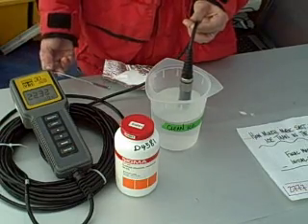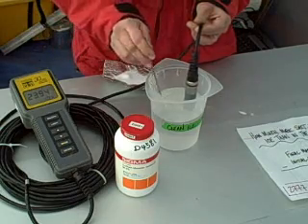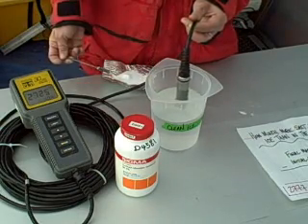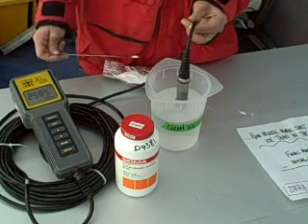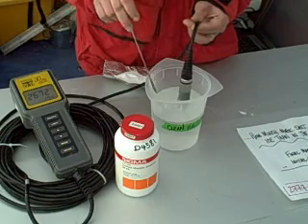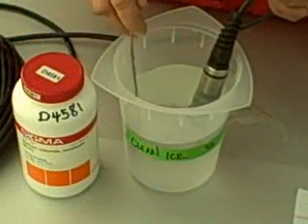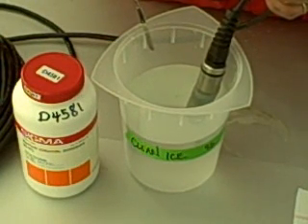So that's probably going to be maybe a little bit more because we just dropped a bit. Dropped again, so a little more. Alright, and with this last stir, we should be just about there with our readings.